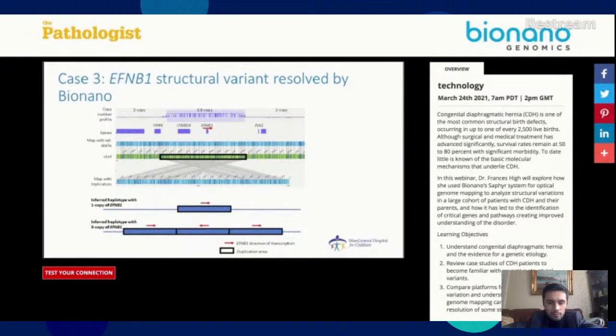What was quite interesting is when we used Bionano to study an individual from this family, if we look at the copy number profile that's at the top in lavender, there's a copy number gain here, but it appears to not only be a duplication, but actually a triplication. So you can see a copy number of 3.8 on average in that call.